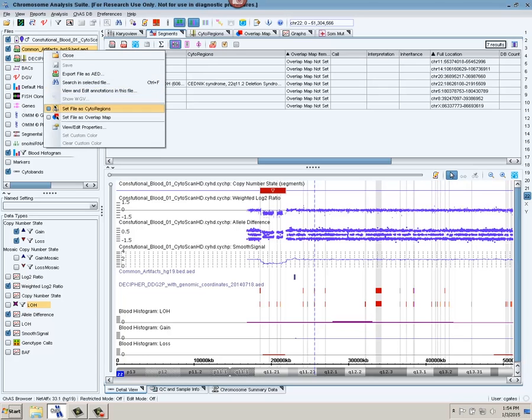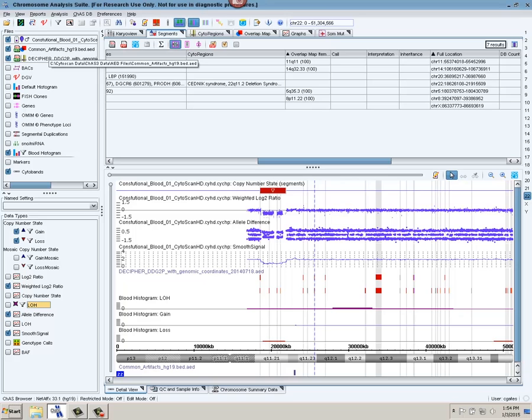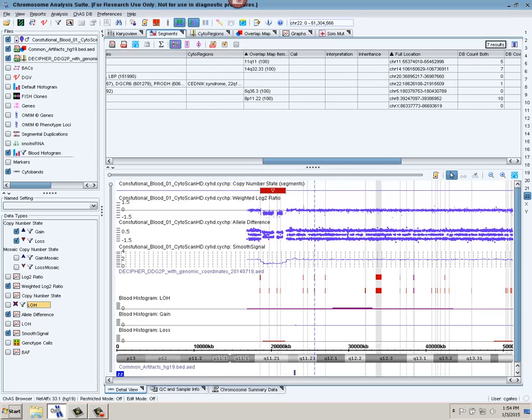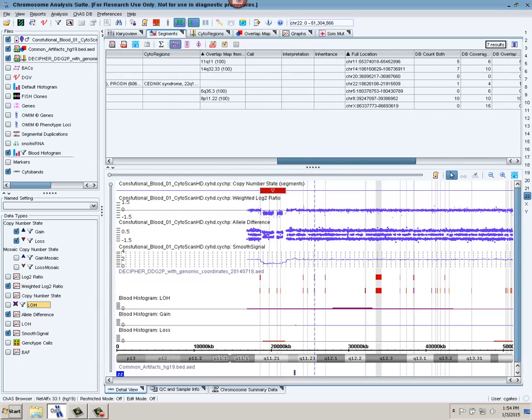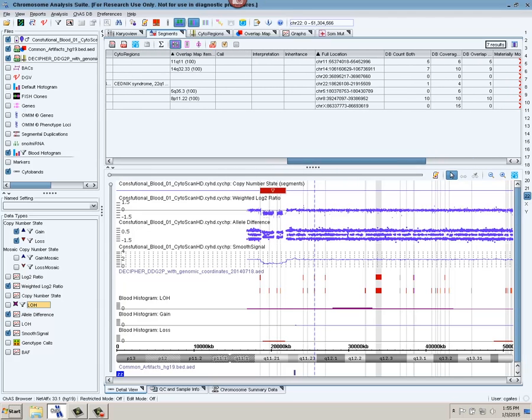I'm then going to assign my common artifacts file as the overlap map. These are regions of the genome that may be segmental duplications or are just known to be found in several samples to come up that are not clinically relevant. So I have my cytoregions column and my overlap map. I'm going to keep them in the field of view.